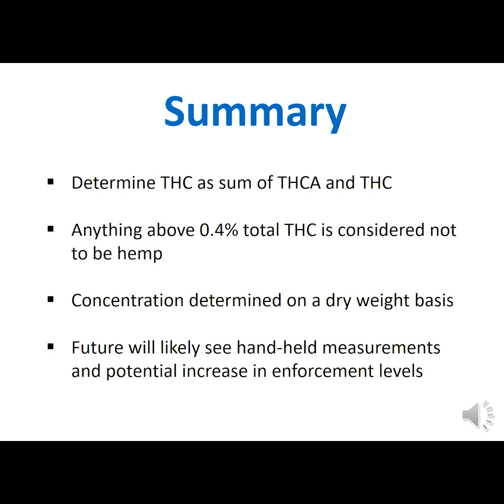So in summary, I talked about determining total THC as the sum of THCA and THC. The 2018 Farm Bill made it clear that total THC should be considered in analysis to determine the concentration of total potential THC that is psychoactive and gets an individual high.